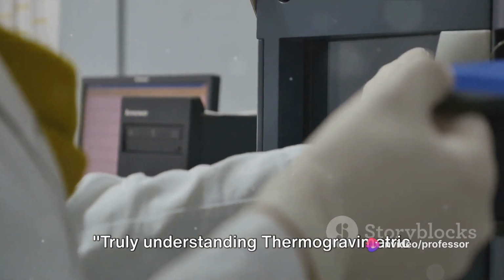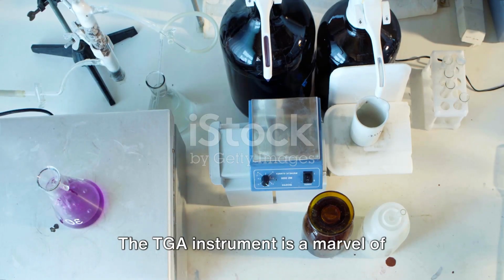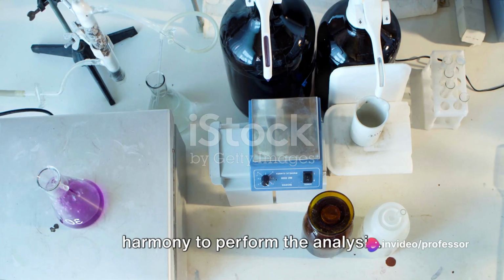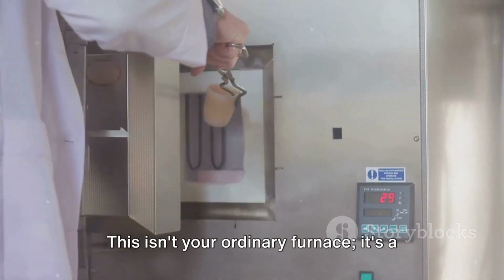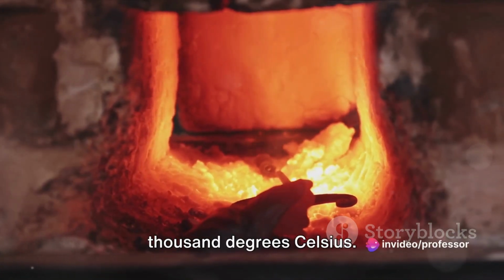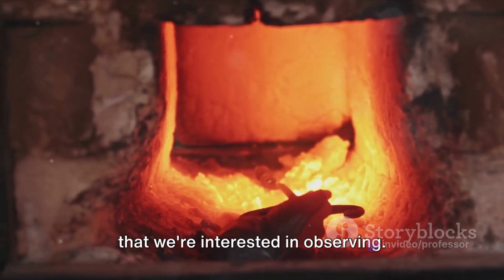Truly understanding thermogravimetric analysis, or TGA for short, requires a closer look at the instruments involved. The TGA instrument is a marvel of scientific engineering, composed of several key components that work in harmony to perform the analysis. Let's start with the furnace. This isn't your ordinary furnace. It's a high-precision instrument capable of reaching temperatures upwards of 1000 degrees Celsius. It's here where our sample will be heated, prompting the chemical reactions that we're interested in observing.